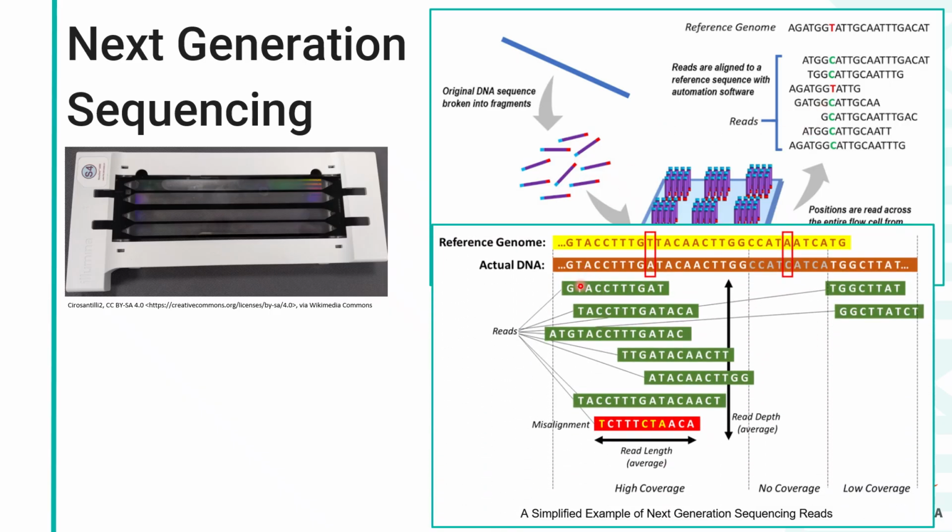So in the green here, each one of these are specific reads. So you can see that they are smaller pieces of the whole. They have overlap because, again, there are a lot of probes that are all designed to cover the area so that you get good coverage of that area, but none of them is a whole. So when you piece all of these together, you're able to see that your value here is an A at this location because you have A. Oh, what's this? You have a T?